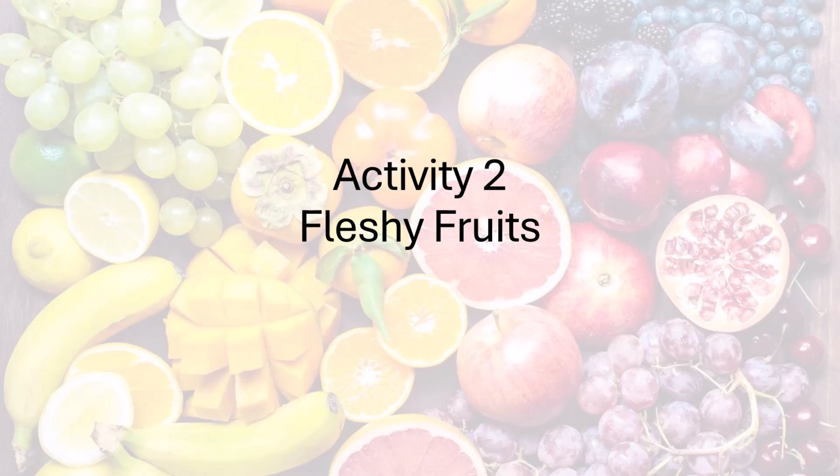In this activity, you'll explore the diversity of fleshy fruits. Fleshy fruits are those in which at least part of the pericarp, or fruit wall, becomes soft and edible. As you examine different fruits, you'll see how fruits vary in their structure and in the tissues that contribute to their development. You'll also observe how fruit structures help protect seeds and promote dispersal, often by attracting animals that eat the fruit and transport the seeds to new locations.